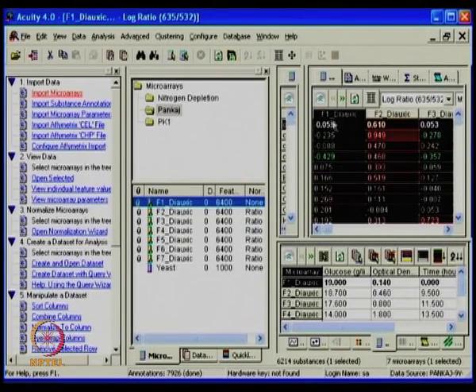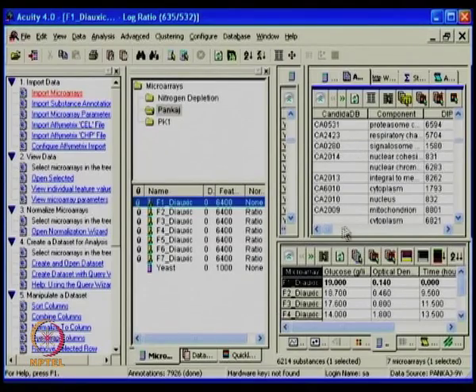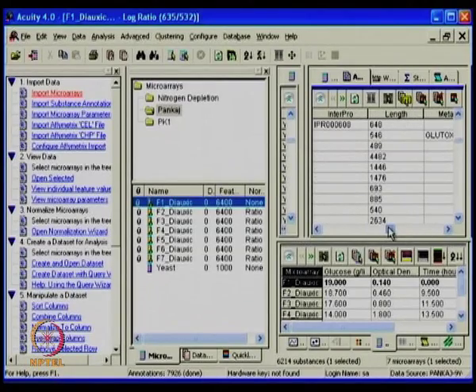So here I'll show you in the form of tab data in the annotation, one can look at what different information can be seen tab-wise. You have the same annotation tab being given for the substance ID, and because each database of Candida is being attached here, component, different functions, even at the level of enzyme commission numbers, there are different annotations which people try to get in, which you can also import in the form of text delimited, renamed to .sdt file, which allows one to take all the annotation information possible.